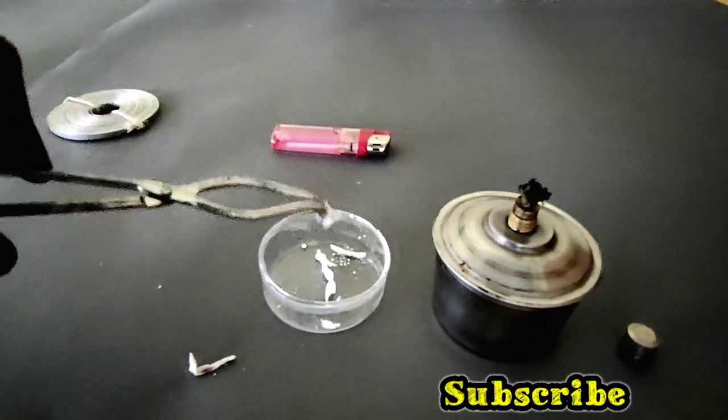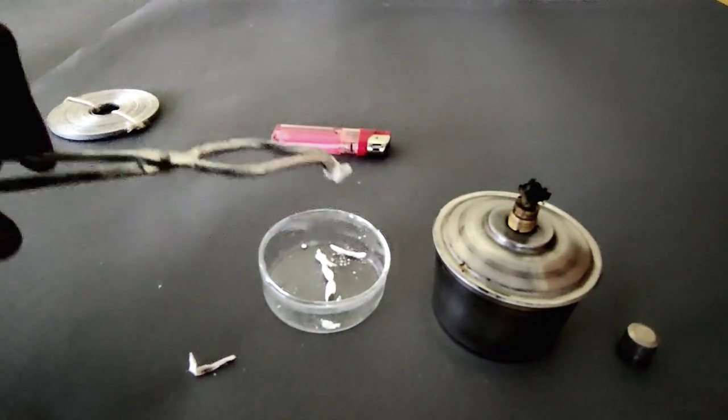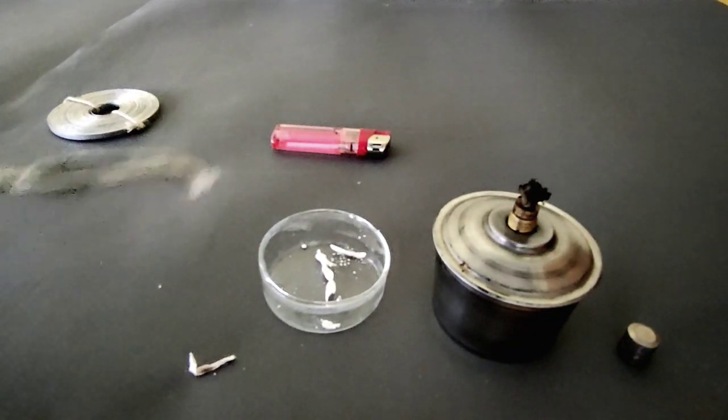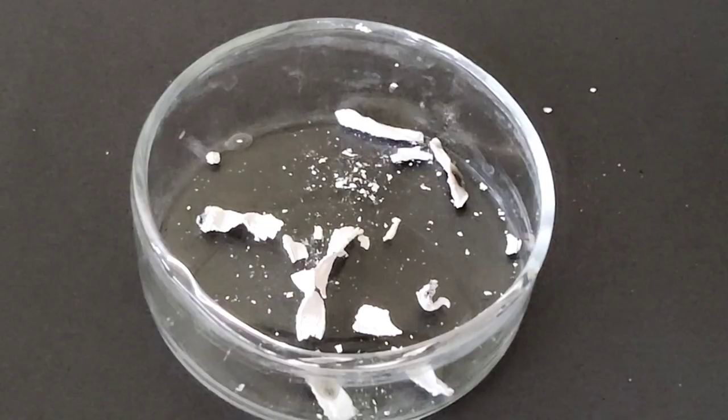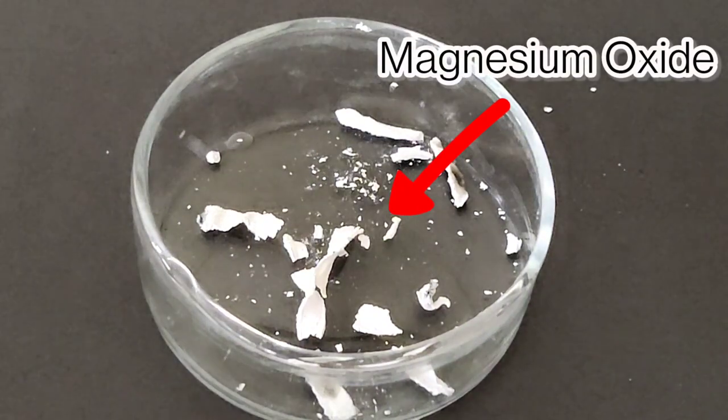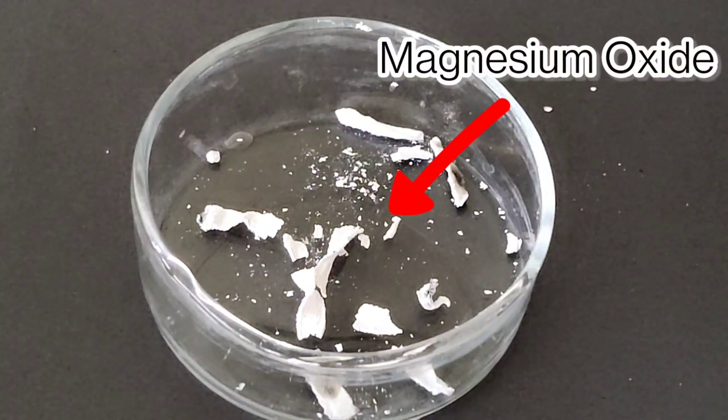In this reaction, magnesium and oxygen combine to form a new substance, magnesium oxide. We will see that closely in the petri dish.